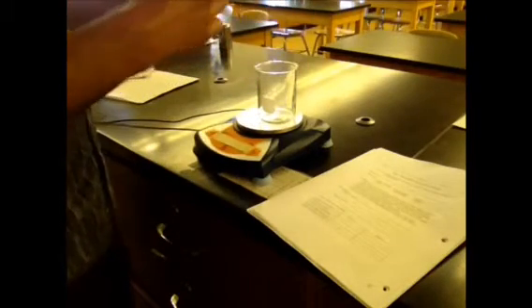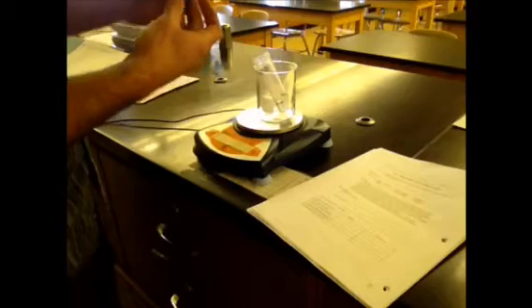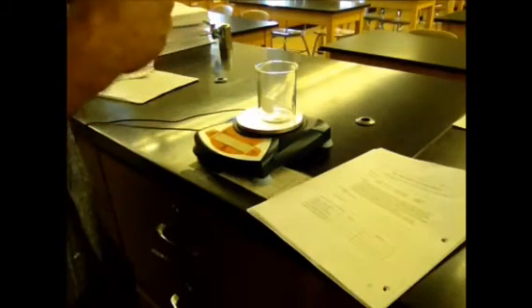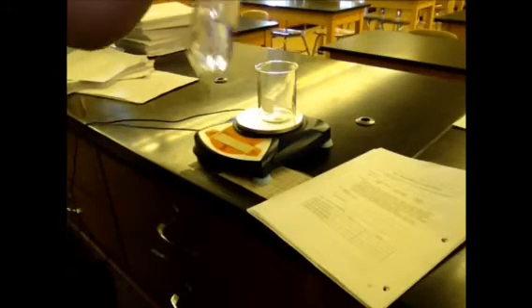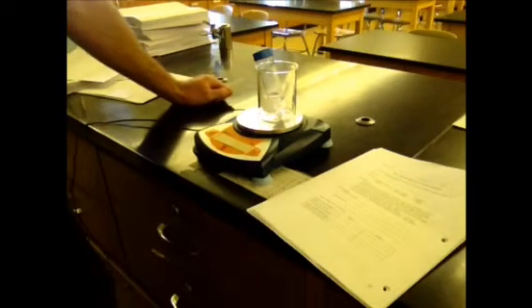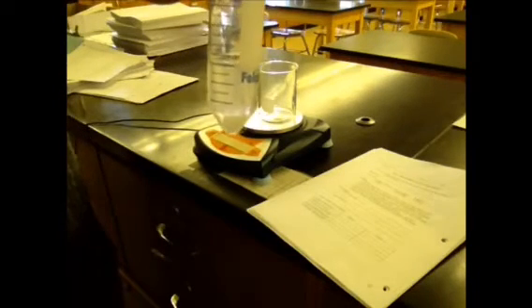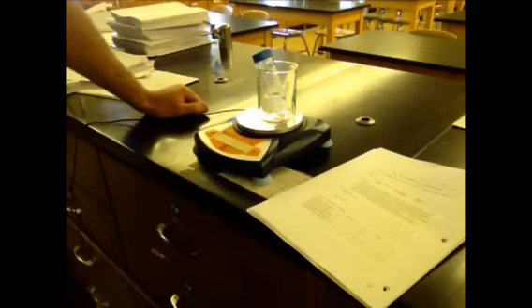Now what you're going to do, and this is where people will make a mistake, or it'll be easy to make a mistake. You want to get this lid on top of the vial as tight as possible. So when you tip this over, get that as tight as you can. And you want to tap that on the countertop, and it's going to start reacting. Now this is an old piece of Alka-Seltzer, so it's not reacting that fast. And you put it on the balance. When it's done reacting, and you'll know that because it won't be bubbling anymore. So this one is still going. When it's done reacting, you're going to write down the mass.